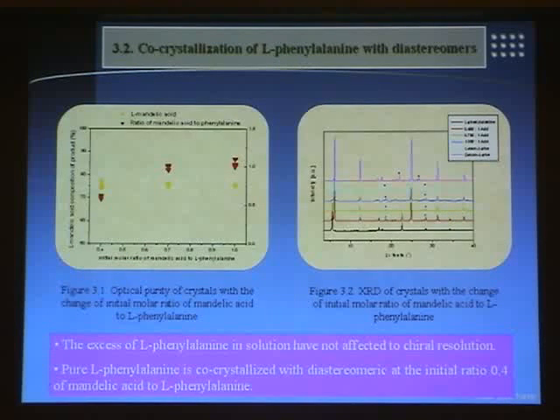So I suggest that in this case, L-mandelic acid L-phenylalanine will co-crystallize with the diastereomer.